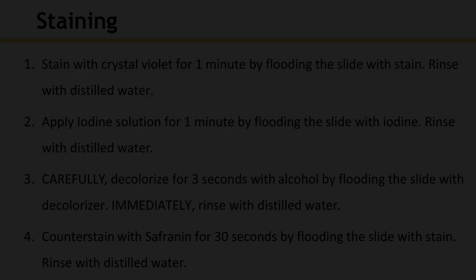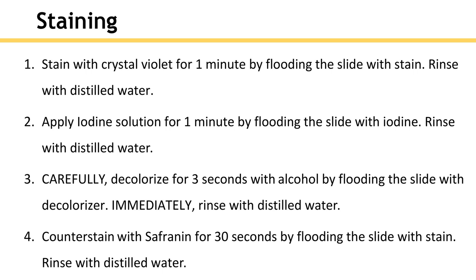Now for the staining: stain with crystal violet for one minute by flooding the slide with stain. Rinse with distilled water, then apply iodine solution for one minute by flooding the slide with iodine. Rinse with distilled water, then carefully decolorize for three seconds with alcohol by flooding the slide with decolorizer, and immediately rinse with distilled water. Finally, counter stain with safranin for 30 seconds.